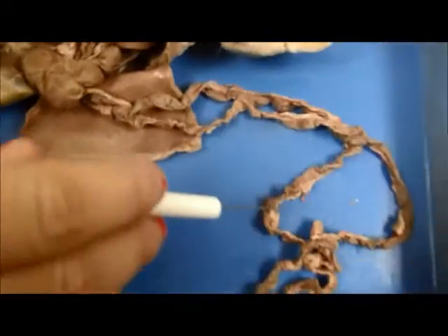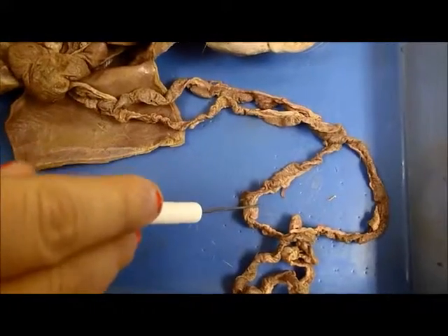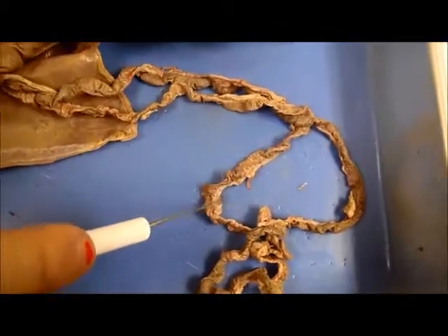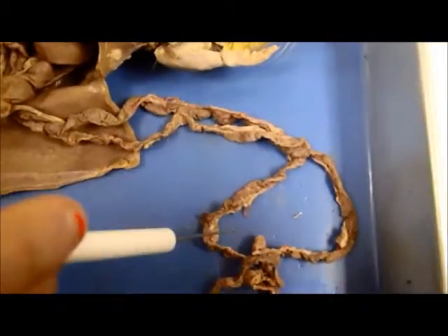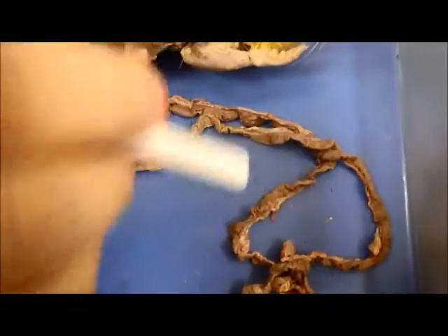Outside the stomach, right here, we have the small intestines, which is a slender coiled tube that receives partially digested food from the stomach. It consists of three sections. The connective tissue and network of blood vessels that connects the small intestines is called the mesentery, and that is what we cut to get the small intestines outside the body.